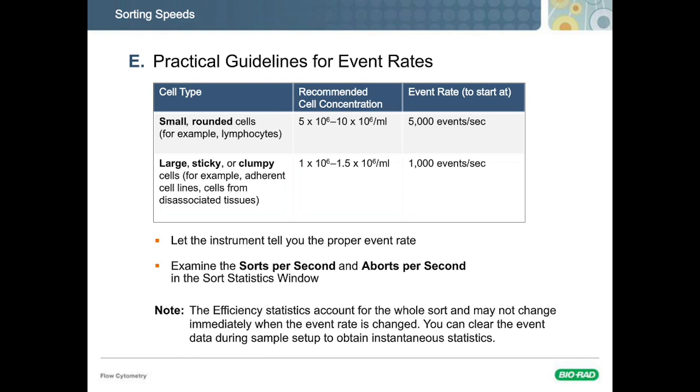So keeping that in the middle range, even up towards 50 microliters per minute, is a good target. And as you can increase that cell concentration, you can start out running a little bit faster. On the inverse, if they're sticky cells, you want to start out more dilute so that your cells are less likely to be next to each other to stick. And you want to start out a little bit slower because you're going to be running more fluid through. And of course, there are starting points. So frequently you can run considerably faster than these numbers.